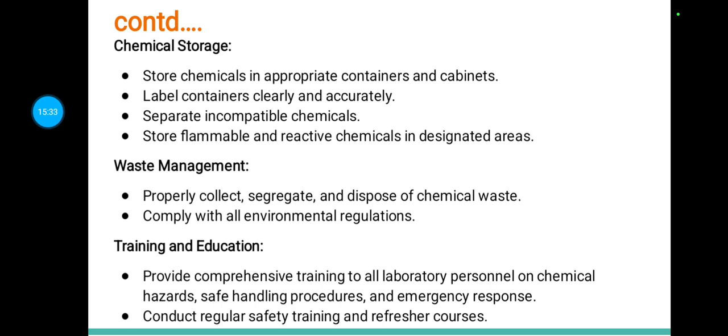Waste management. How to manage the waste that is there in the laboratory. We have to collect the waste properly, then segregate it and dispose of chemical waste. Comply with all environmental regulations. When disposing of the waste, it should not contaminate the environment.